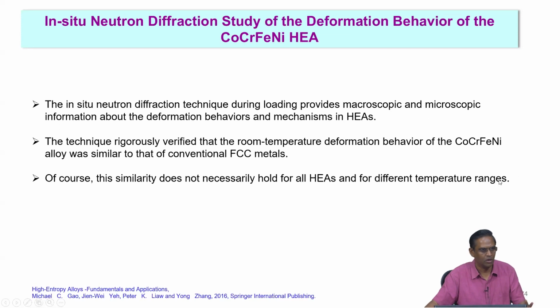So, this is just one coincidence that it appears similar, but for detecting the deformation behavior very closely, you need these kinds of neutron diffraction experiments, which can capture the deformations much more closely. I think I will stop here, then we will continue in the next class.